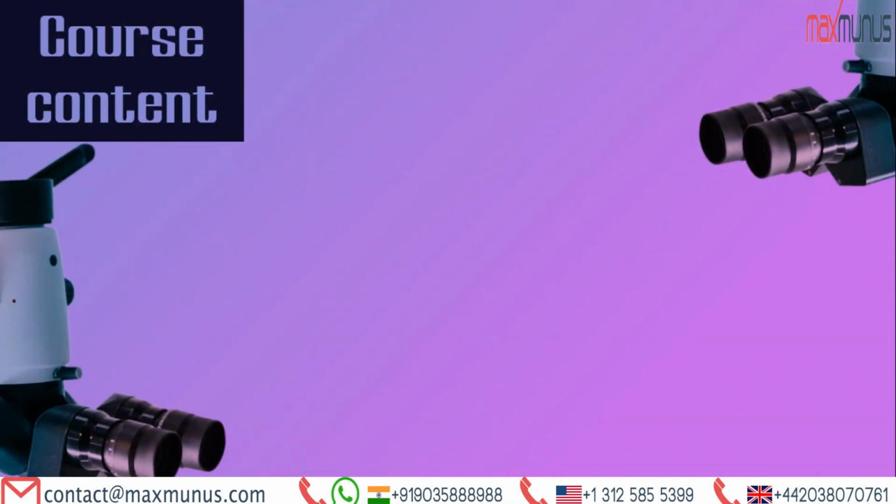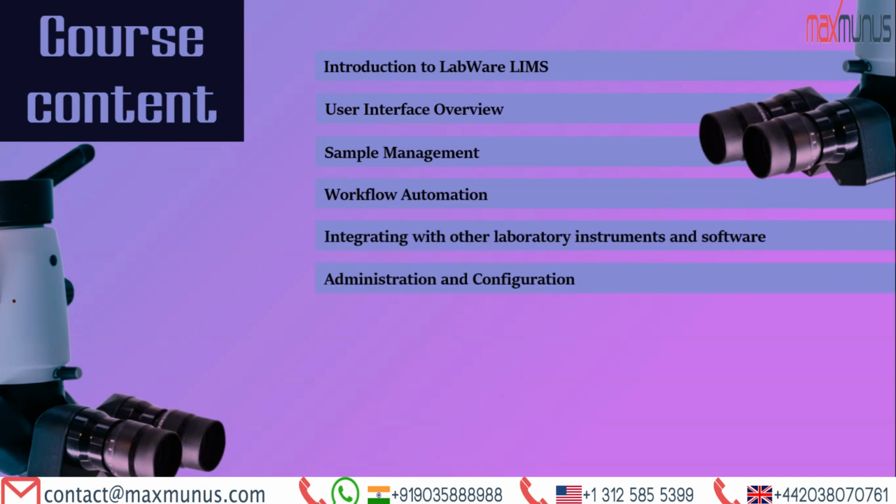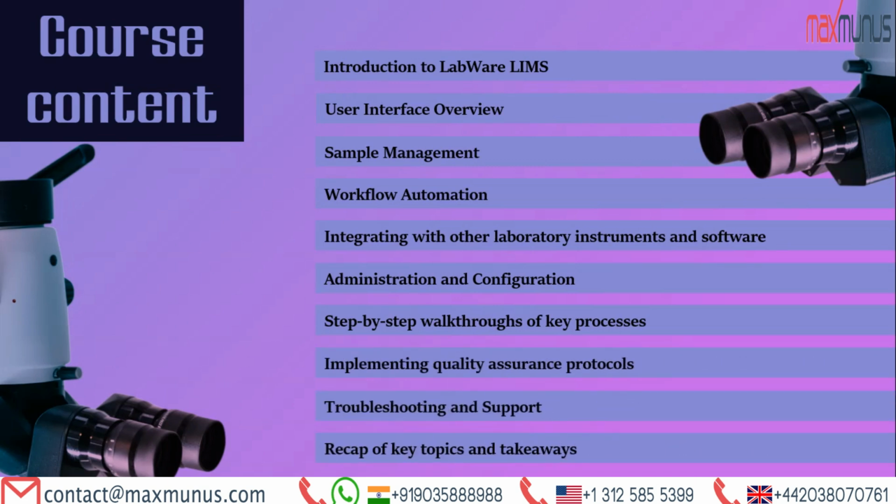Next, we have the training material for Labware LIMS. Let's look at it. The instructor has provided you with a list of a few subjects that will be covered as a part of the course material. The themes are listed below for you. Let me read.